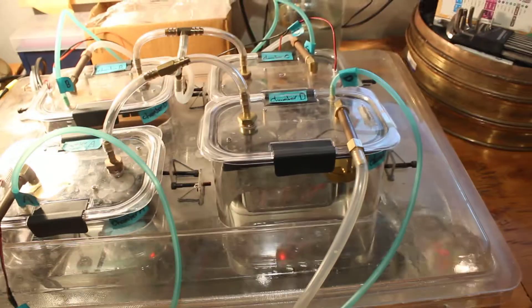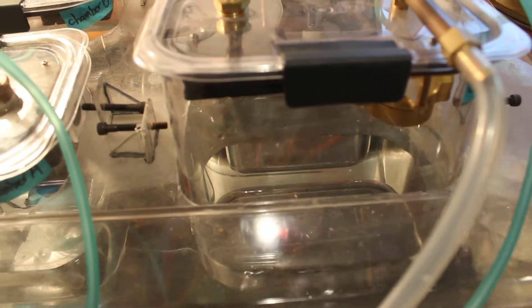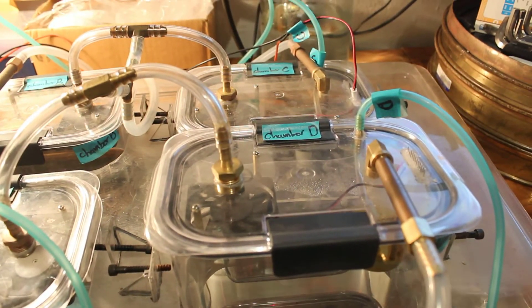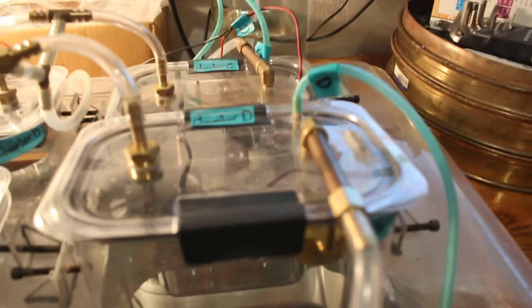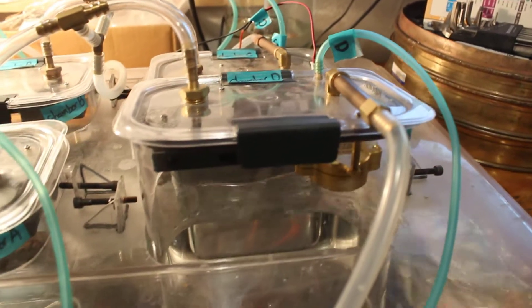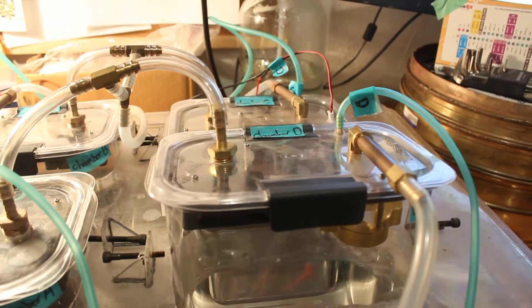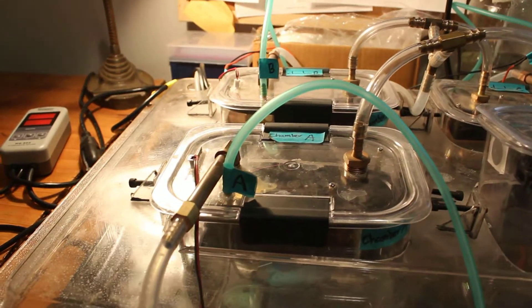And in these chambers are the soil samples and air is constantly being circulated through each chamber. And you see those green lines, that's the sample line for the CO2.